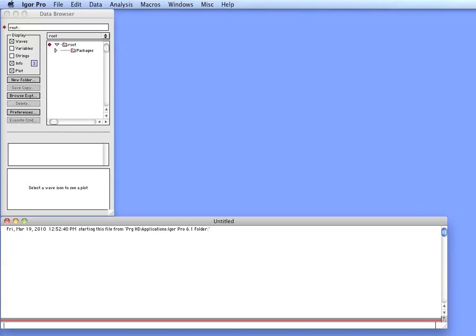In this movie I will document and explain how to use the Unified Fit tool in the IRENA package. For many more details please see the manual where there is a detailed description of all the IRENA tools.